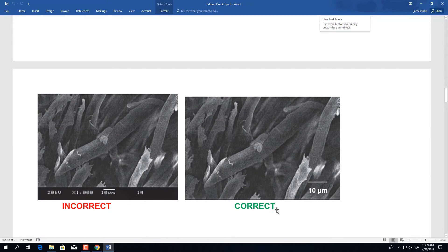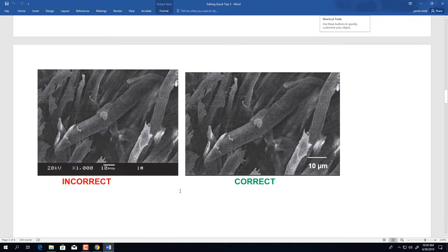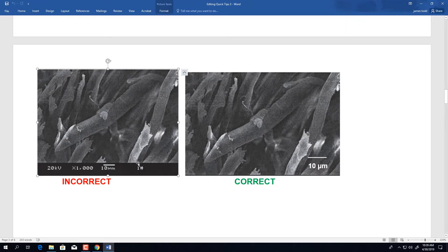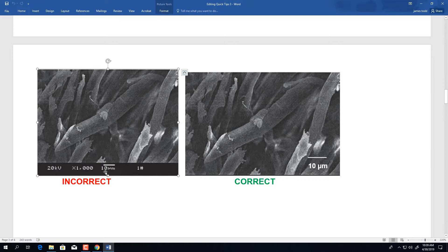Moving on, we have another case of an image submitted where the microscope generated information is still left on the image. In this figure on the left hand side, we have the black bar containing microscope generated information, as well as there is no space between the numerical value and unit of measurement in the scale.